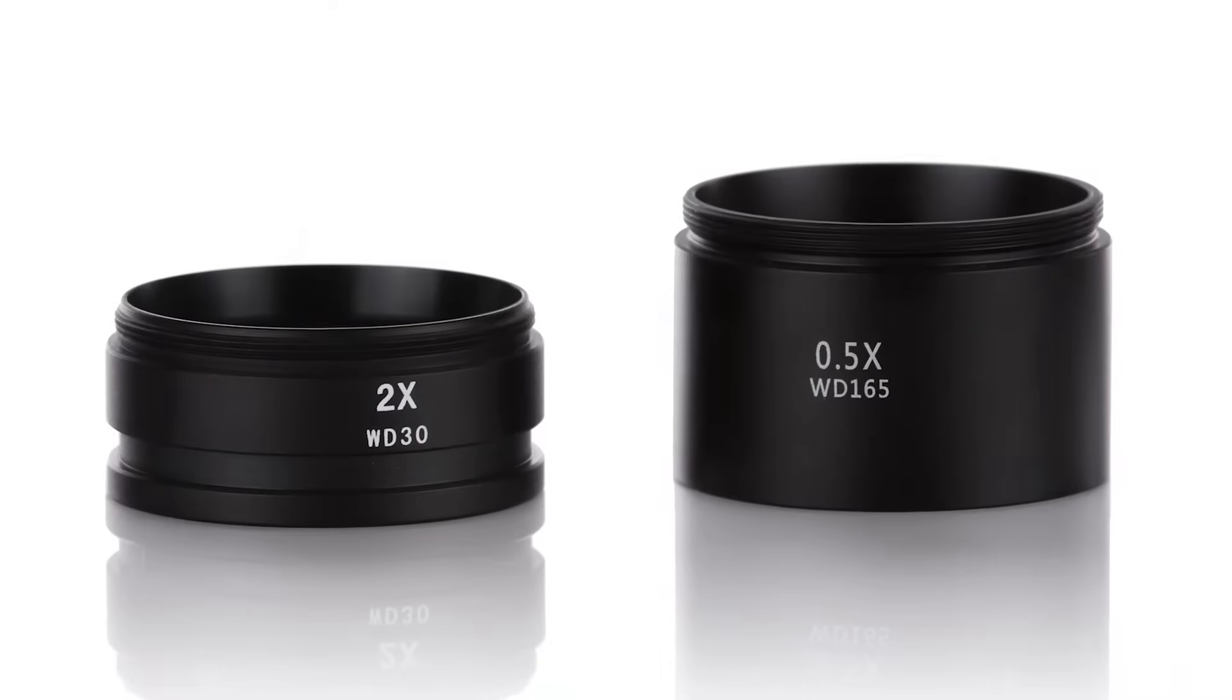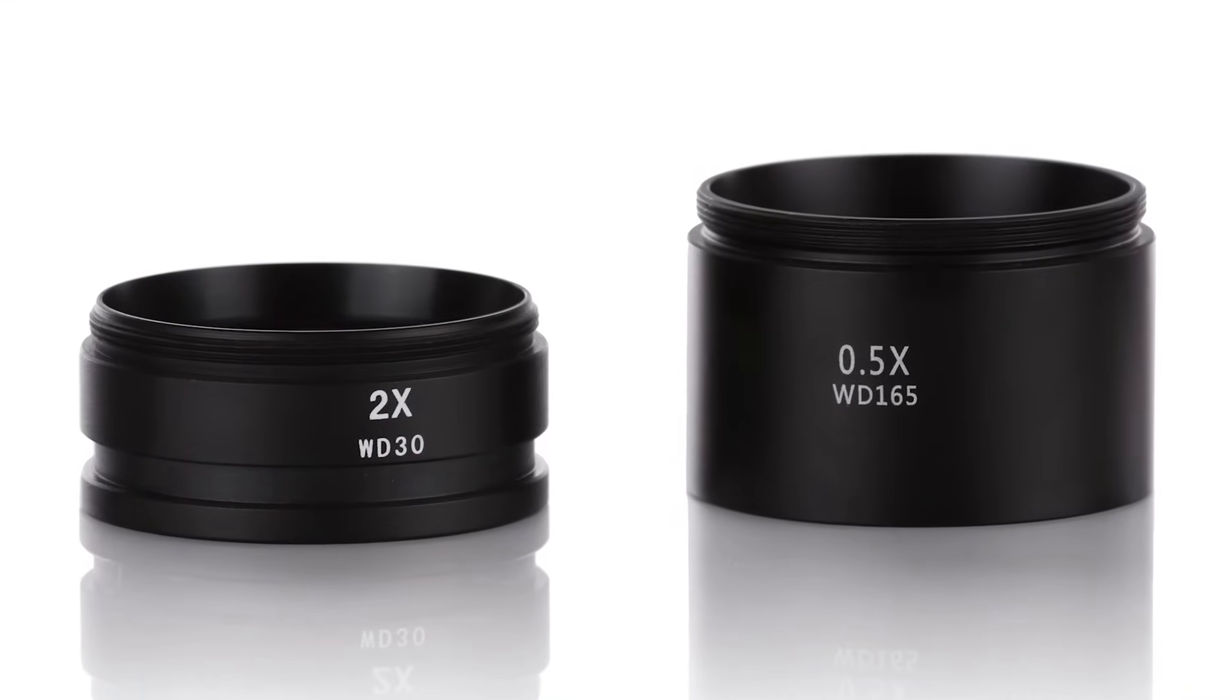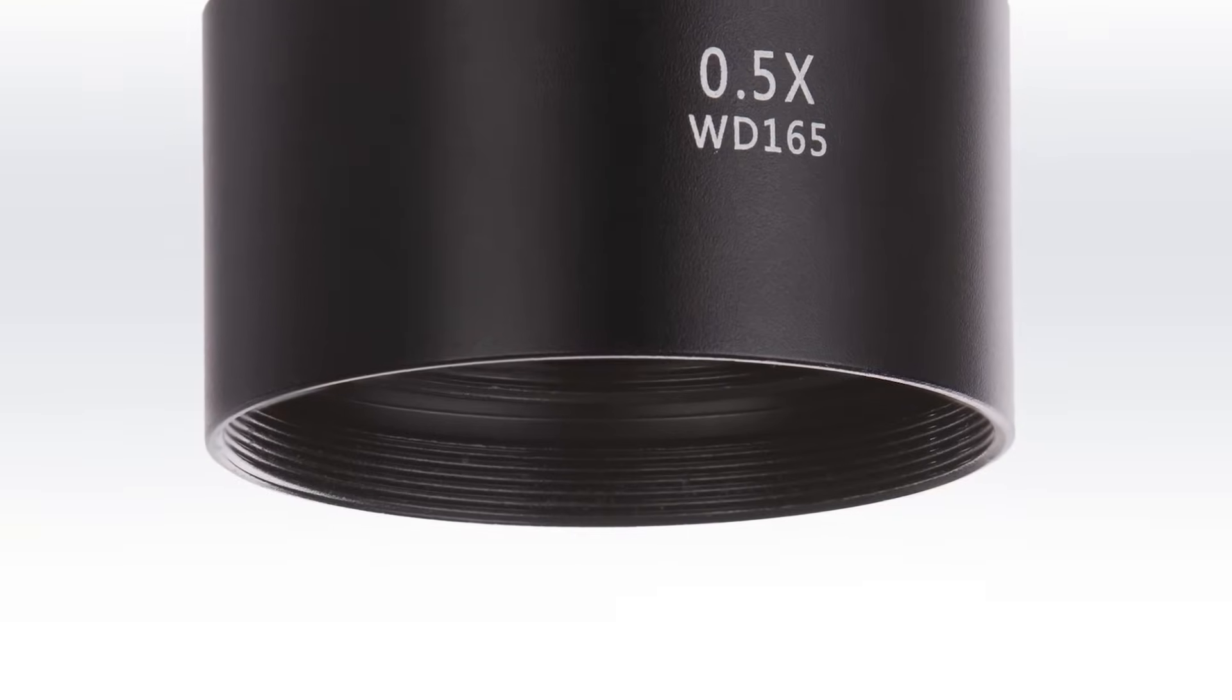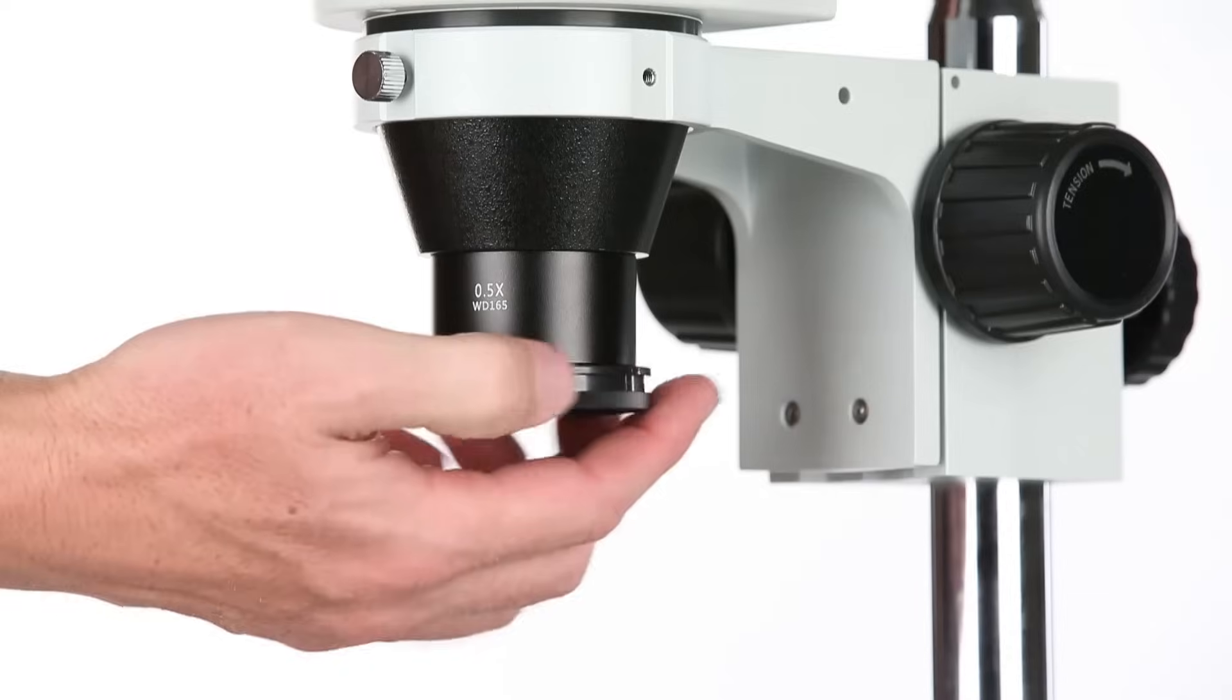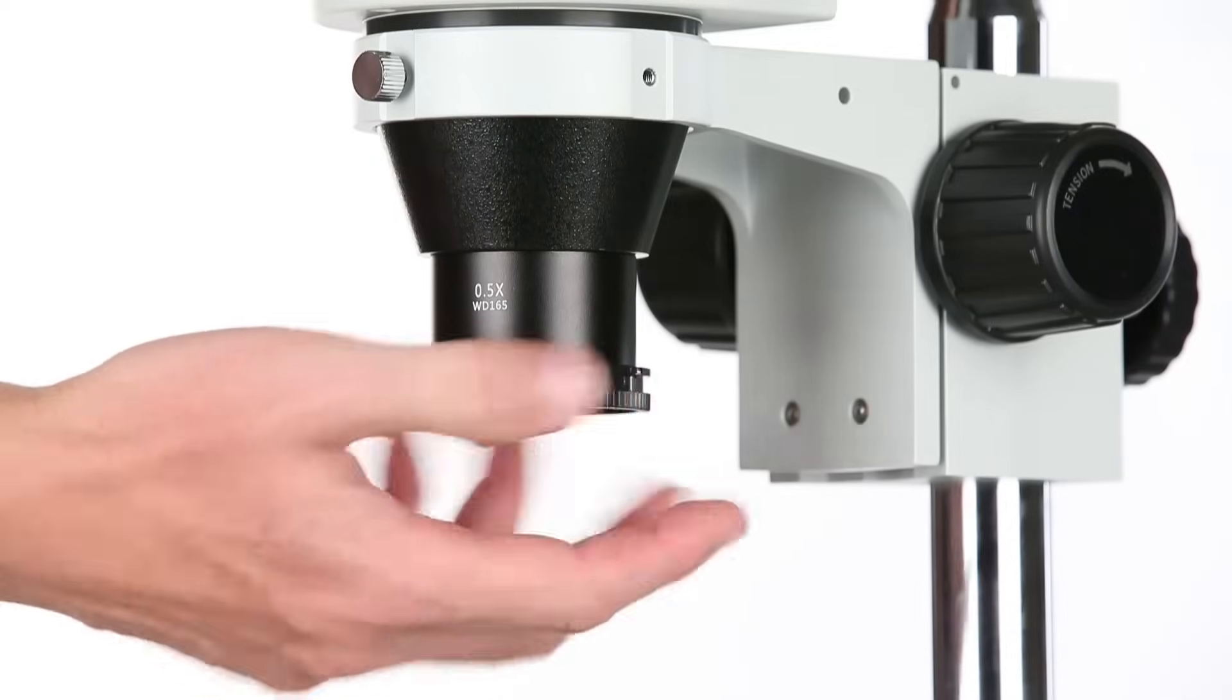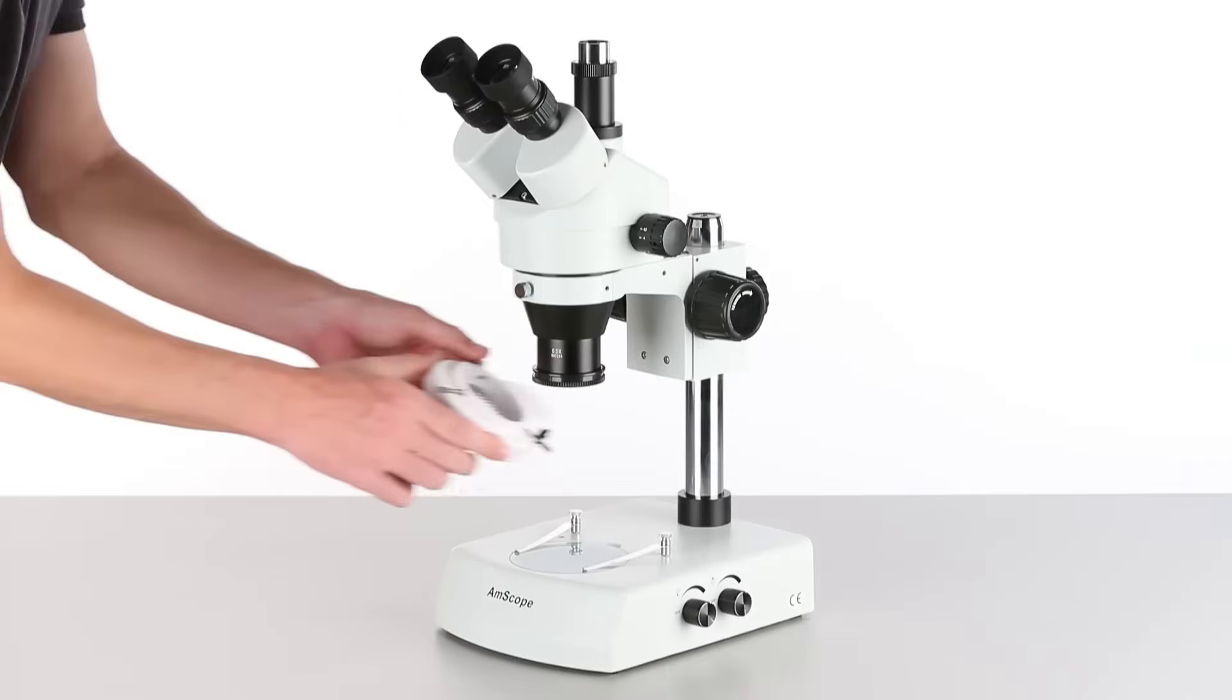A ring light can also be attached to each of the Barlow lenses. The 0.5x Barlow lens has a threaded port. Simply screw on the threaded adapter ring, and then mount the ring light.